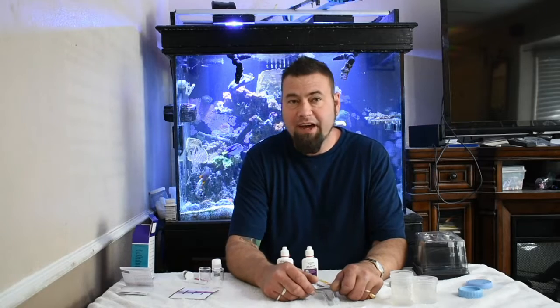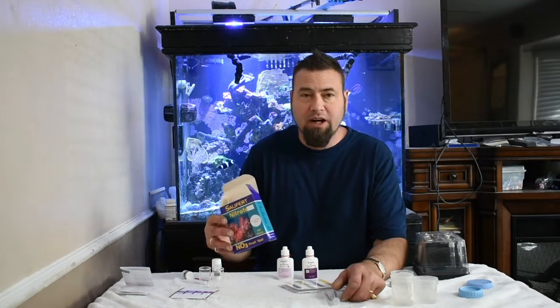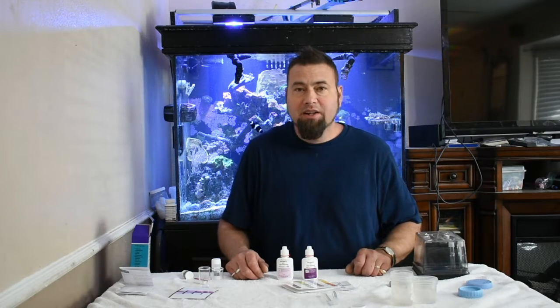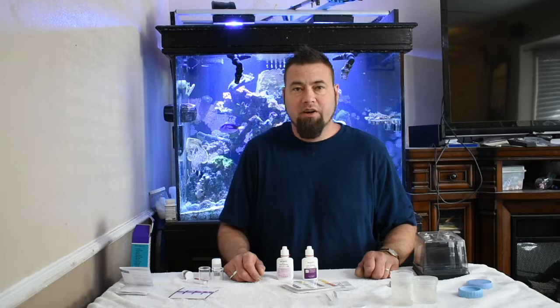Today's video we're going to be comparing the less expensive API test kit to the more reputable Salifert test kit, specifically doing nitrate. So let's just jump right into the testing and then we can go over results and opinions and all that kind of good stuff.